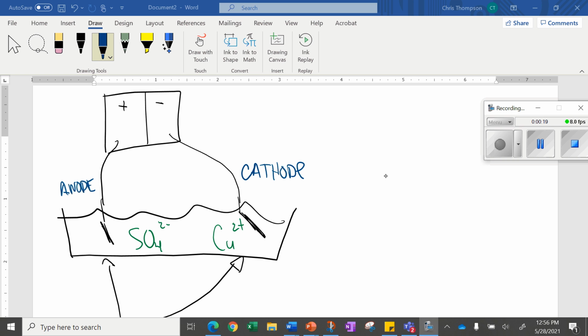I chose to use copper sulfate as the one we're looking at. We did 3 different solutions. You don't have to do all of them. I said to include at least one chemical reaction in here. So let me get the setup, and then I'll give you the reaction that you can use. You could have used any of the other 3 that we had.